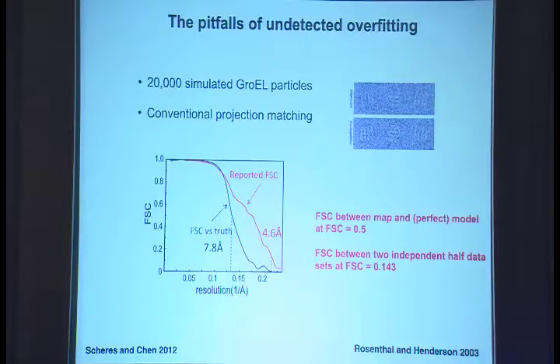The most important thing is that in the EM map, the resolution is not uniform. It's going to be different. In the core regions, it is going to be better. So whatever these values tell is the overall resolution of the map. It's always better to look at the map and then decide what kind of resolution it is. I personally don't like it when I say I have a map of 3.8 and most of the periphery is about 6. Of course the editors will like it and they'll publish. But if the biology is on the periphery, then I will not be able to interpret it. So that's something to remember.